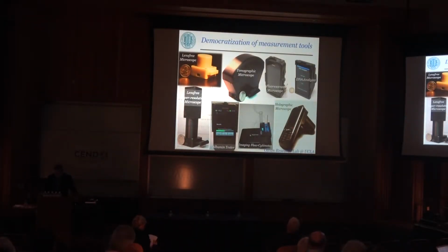So some of these devices are using the smartphone as a platform for microscopy and sensing at the intersection of computation and optics. At the same time, sometimes we're very interested in utilizing components from the smartphone to form computational images. In fact, what you see here on the left, these are computational microscopes where the main component, in addition to computation, is a CMOS imager, the same 10 megapixel, 20 megapixel imager of a smartphone. And this has come a long way in terms of microscopy and in terms of sensing.